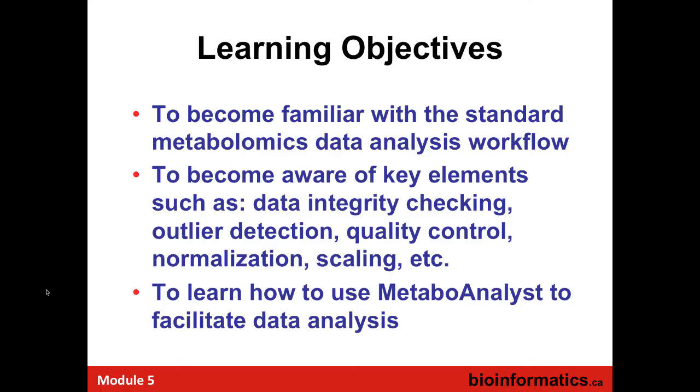So most of today will be devoted to MetaboAnalyst. We'll talk about it, I'll introduce it to you, and then your lab for the rest of the day, or most of the rest of the day, will be focused on using MetaboAnalyst. So we'll talk a little bit about the standard data analysis workflow for metabolomics, so you can understand the basic layout for MetaboAnalyst, because it is structured and it's intended to be sequential to follow or guide you through a standard data analysis workflow.